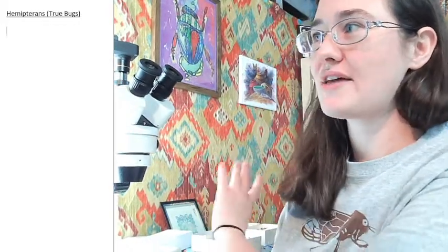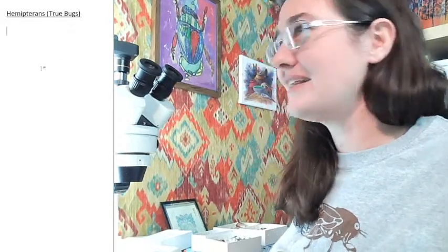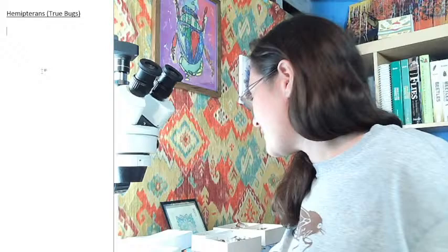Sometimes you'll notice that this side is kind of overlit. It's just because that's my microscope light. It needs to be super bright to show you guys on the screen, and so every now and again you'll see that kind of blurred out. That's fine. All right, so hemipterans.